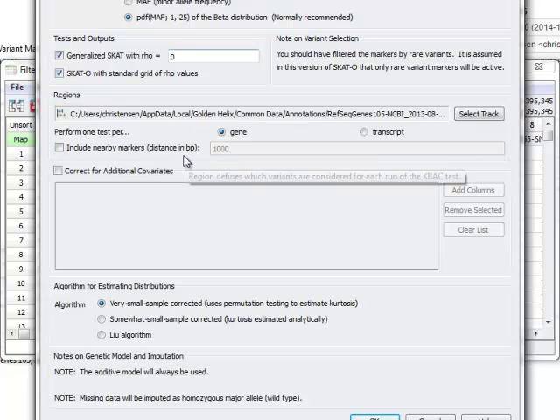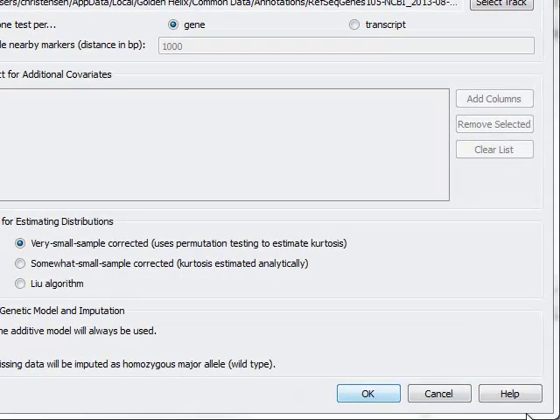Moving down from there, you can make some choices about variants to select, regions to collapse in, and if there are any covariates that you want to adjust for in the model, and proceed then to run the test. We won't do it right now. It takes a bit of time on this scale of data.